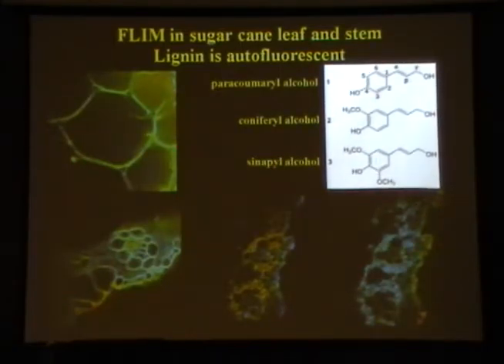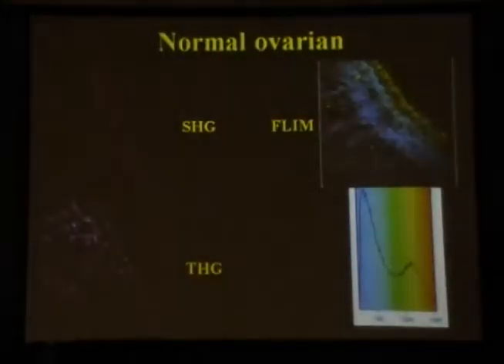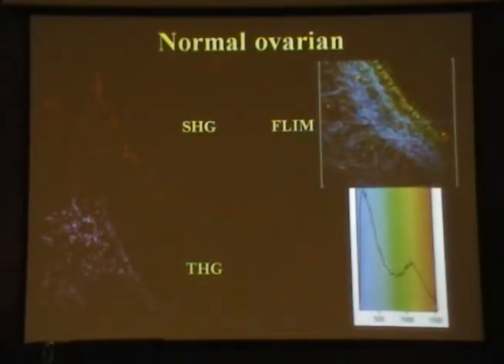It's fluorescent in green. But the point is that you cannot distinguish them just by the fluorescence wavelength. But with FLIM, if you see different colors, spatially localized, it means that you have information here. And so with FLIM, we can decide where they are, we can use it in plants, and even for fixed sample, that's just the second harmonic for the normal ovarian tissue here, and you see both of them here, and even though it was fixed and processed, just take the FLIM image. You can almost see everything that you have here and there in just one picture.